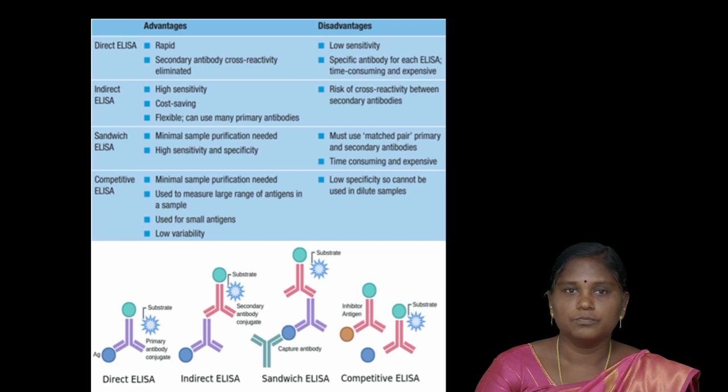So you should understand the types of ELISA and their advantages and disadvantages. Based on that, you can use this technology in your further studies.